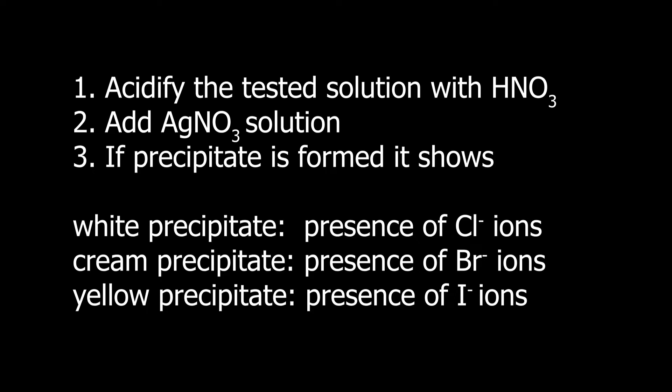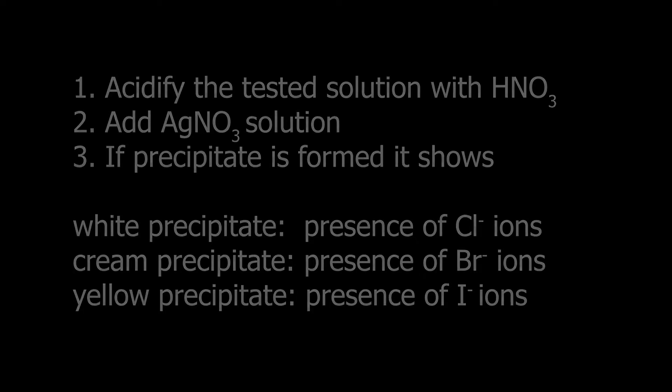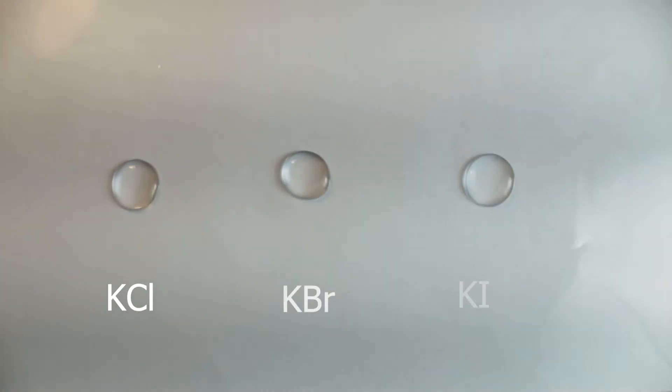White means chloride presence, creamy means bromide, and yellow means iodides. So here I just prepared solutions with chloride, bromide, and iodide.